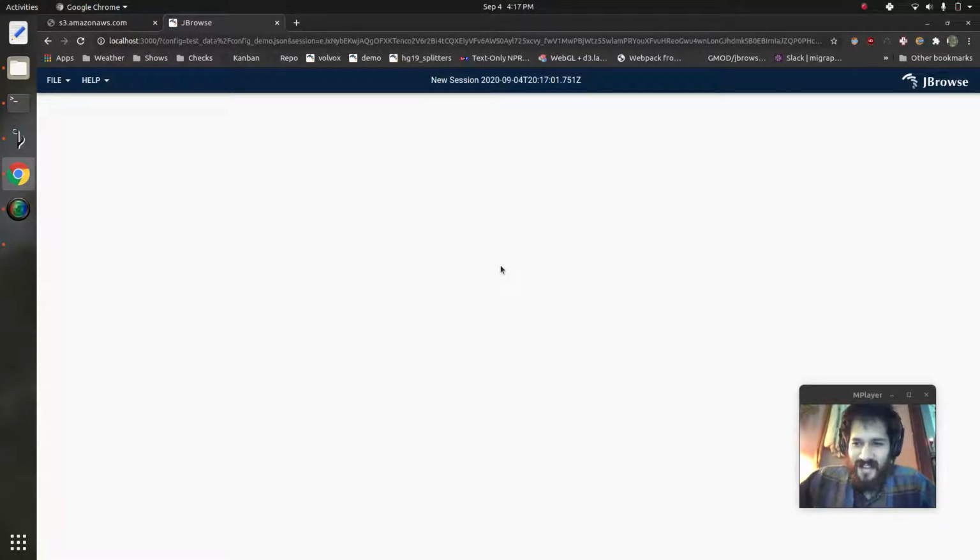Hey everyone, I just wanted to demo a couple new features on JBrowse 2 that we've been working on. I think they really show some of our strengths, and I guess we'll just dive in.